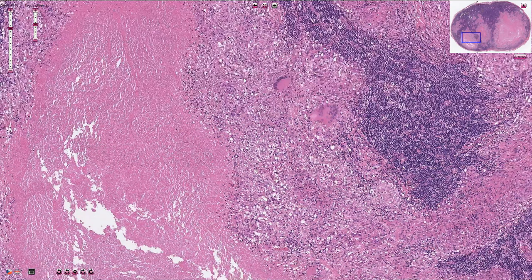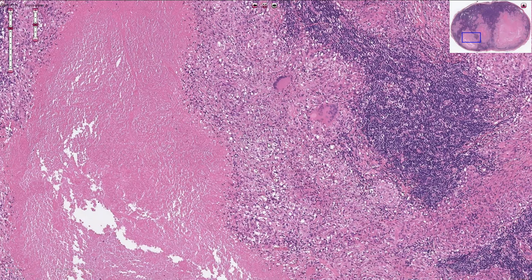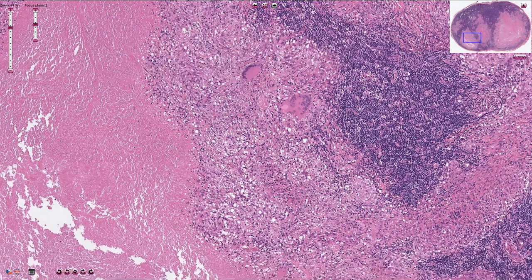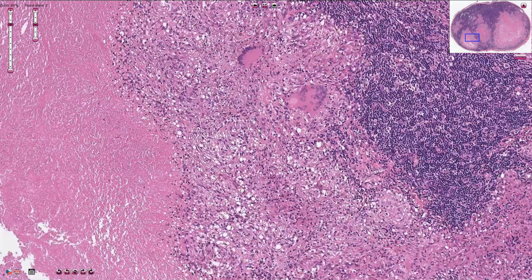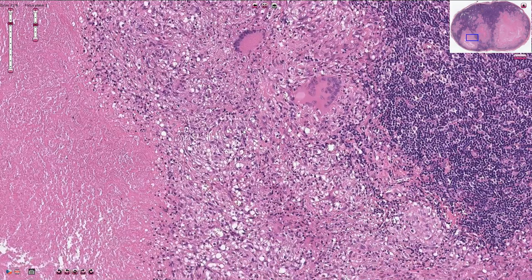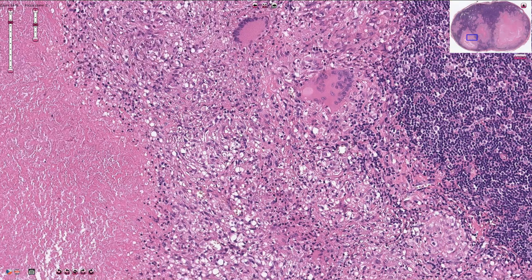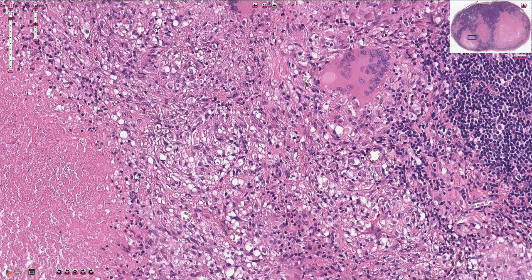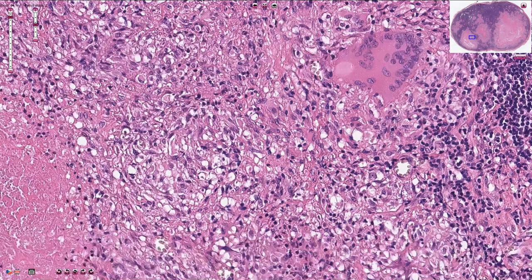Around the caseous necrosis we can see a rim made out of epithelioid cells, which is the hallmark of granulomatous inflammation. Epithelioid cells are large cells with ill-defined cytoplasmic borders containing eosinophilic and large pale ovoid or oval-shaped nuclei. So all of these cells here are epithelioid cells.